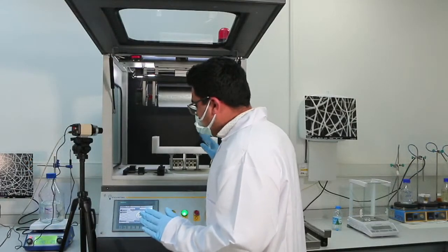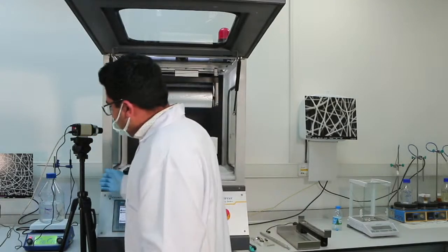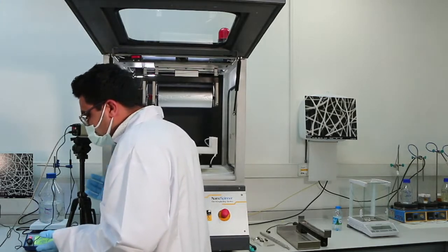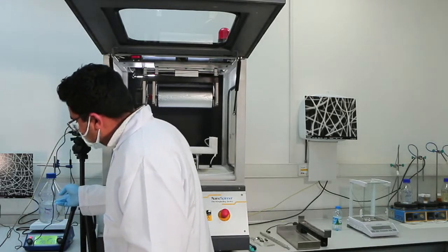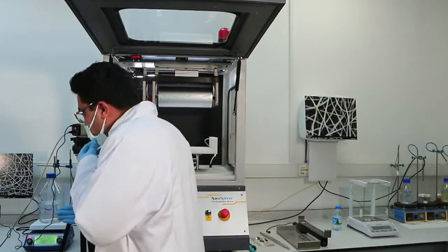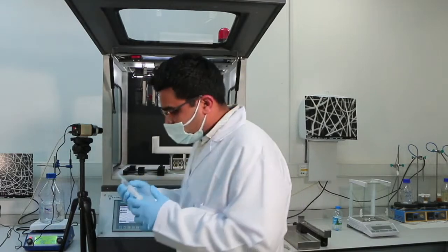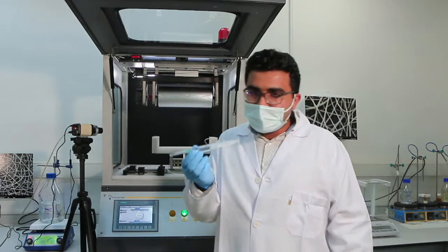But before that, I would like to tell you how we prepared the polymer solutions. As you can see in our laboratory here, we use essentially pellets and we put them in a solvent that makes them dissolve into a solution. We use a magnetic stirrer, which is basically a magnet that stirs at a particular specified temperature, so that the solution will be dissolved. This is how we are producing polymeric solutions. But for the purpose of this demonstration, we've already prepared a ready-made sample for you that we're going to show you.